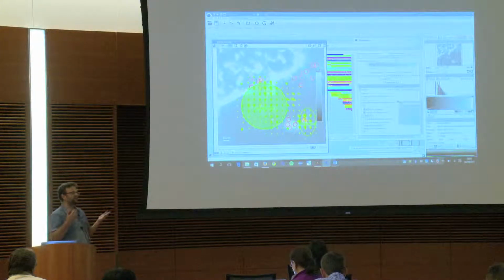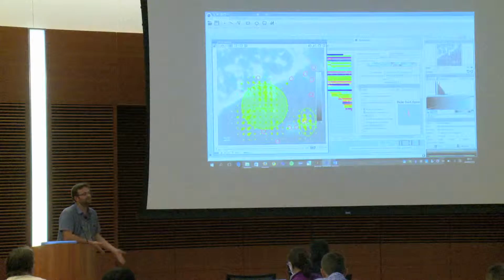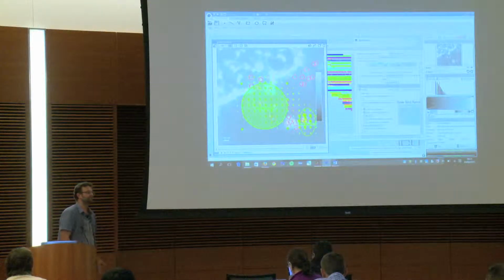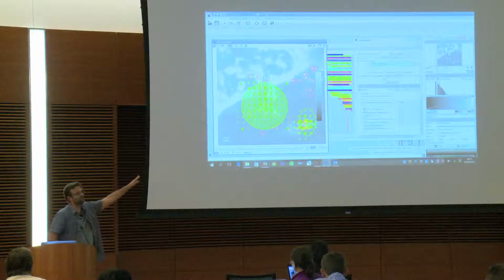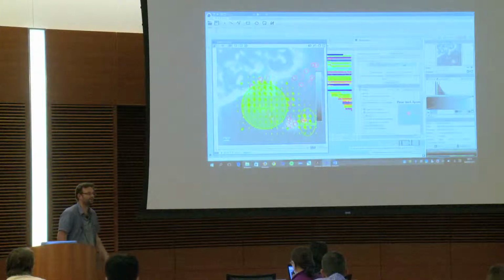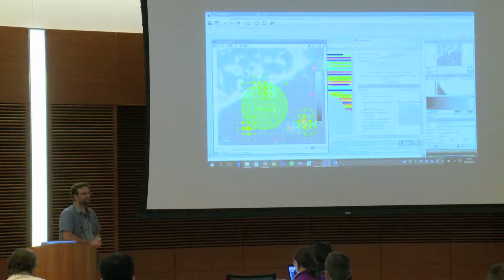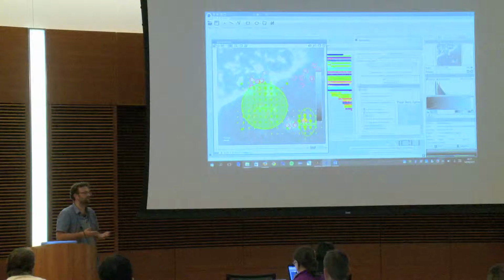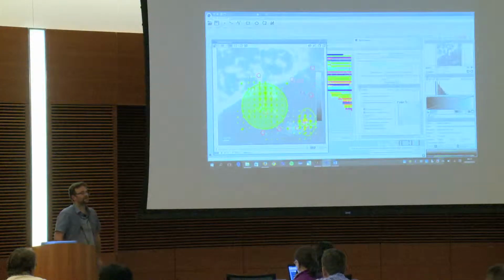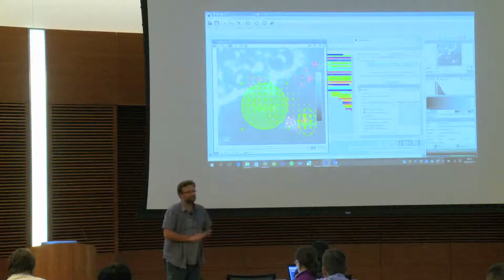In fact, you will have a call to your painter things, and it will provide you a graphic interface, and either you can deal with it, like here it's a graphics 2D, or you can have a VTK scene and you put whatever you want in it. It depends on the viewer. And this thing is extendable too, because we don't even know if you're going to add a new kind of viewer. But it works in 3D, yeah.